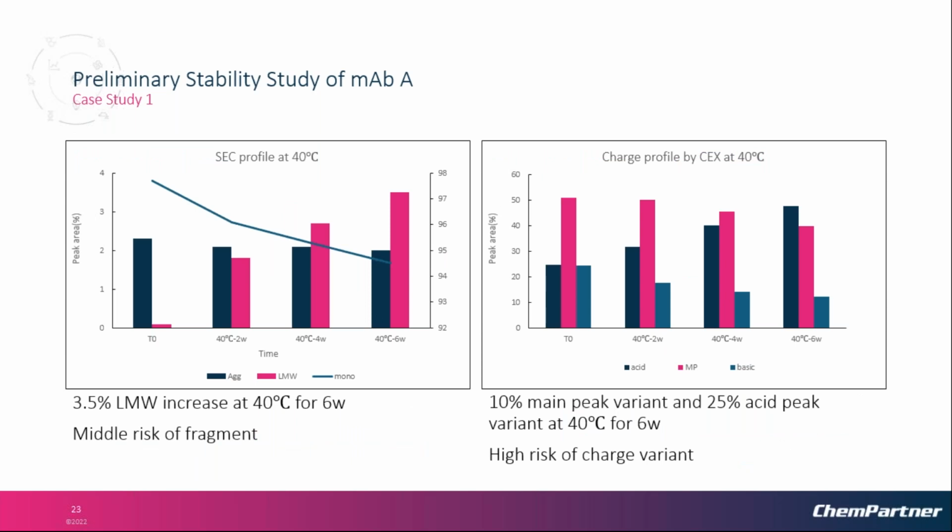Then we conduct the high temperature stability study, and here are the results. From the left figure, we can see that after 6 weeks incubation at 40 degrees, there's a 3.5% increase of the low molecular weight species, which indicates a middle risk of fragment.